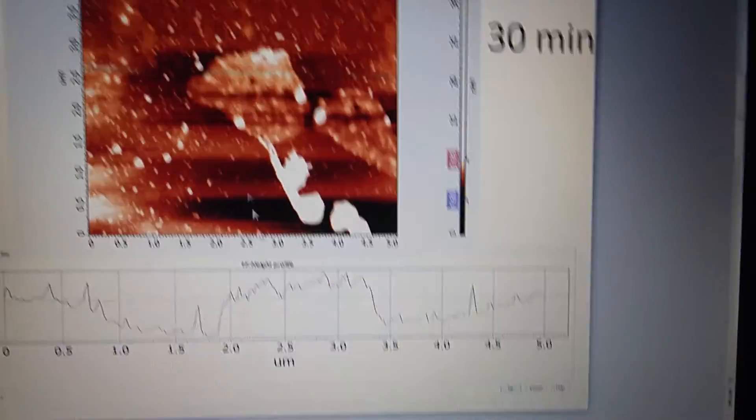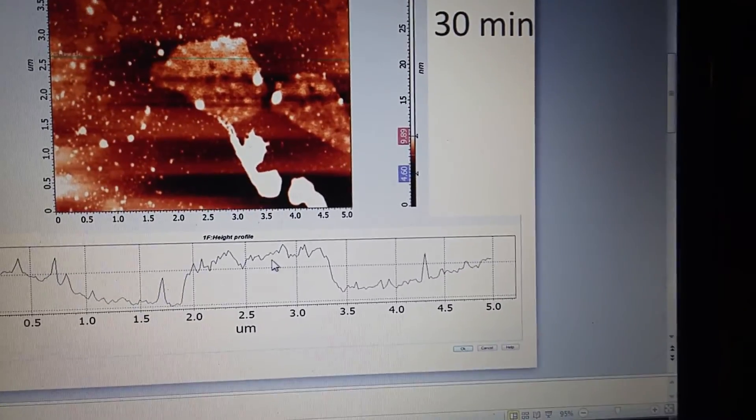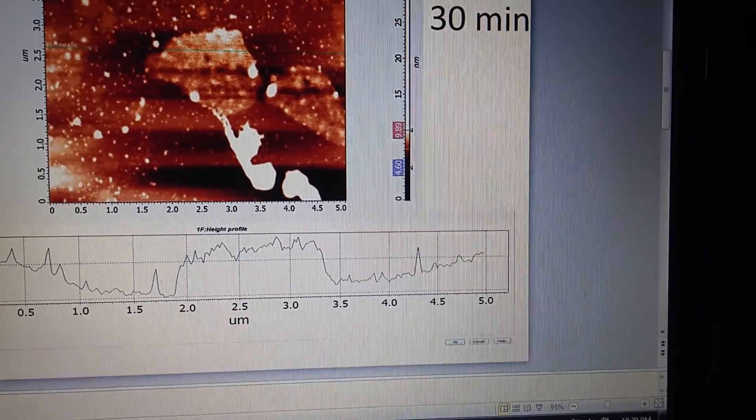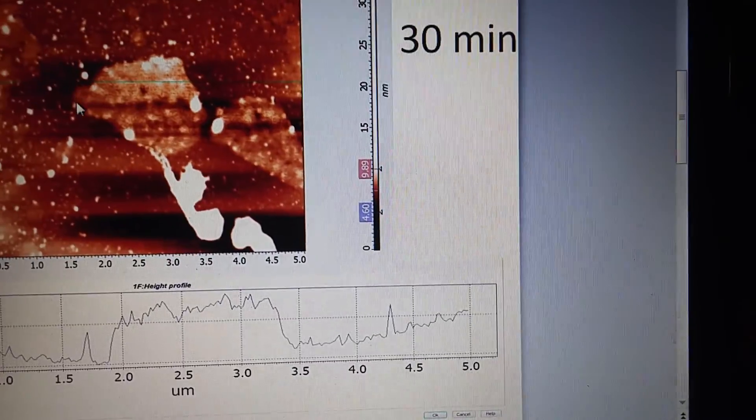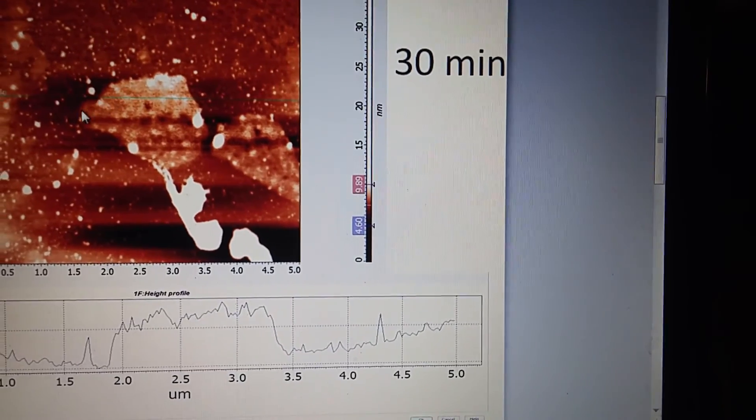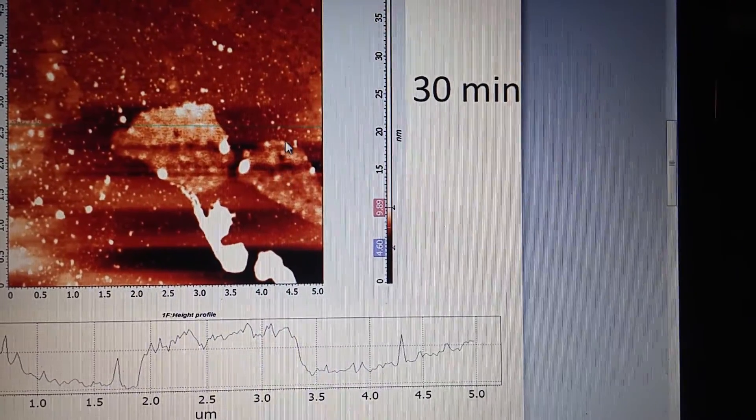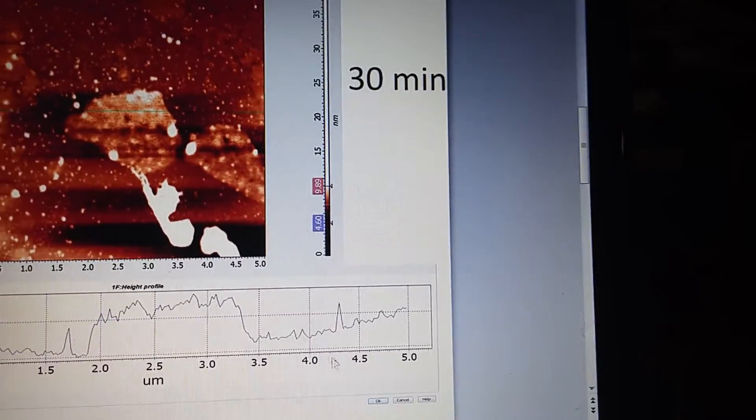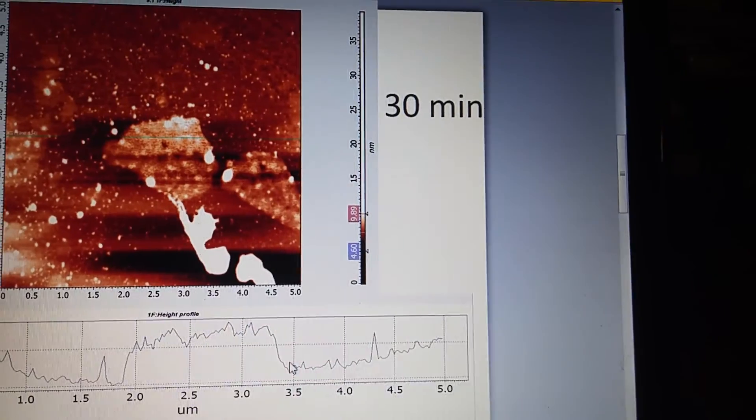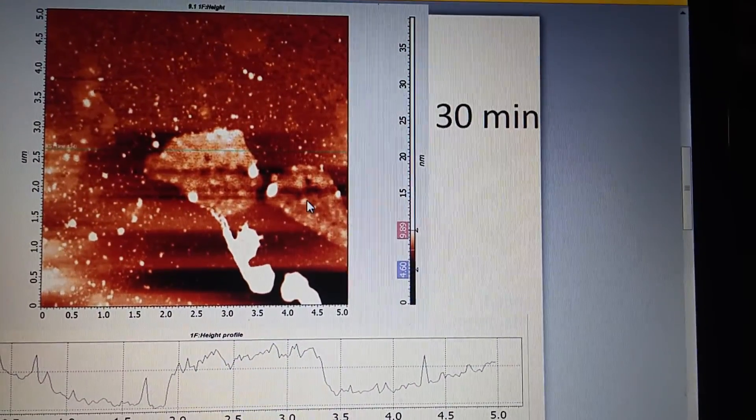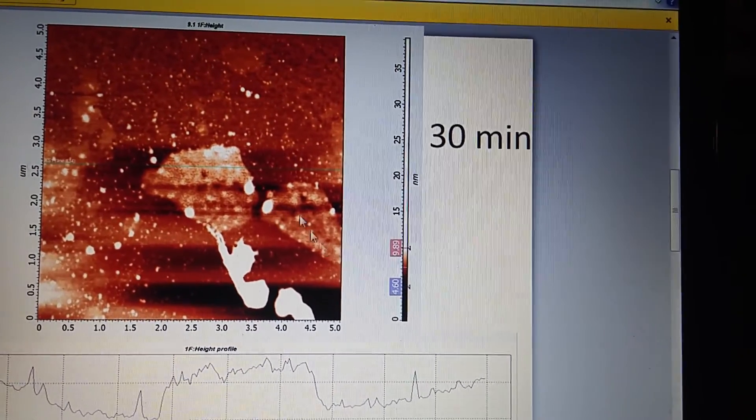And then here's another example. This is 2 nanometers in height right here. If you can see this band, a little bit over 2 nanometers. And then over here, here's another part of the flake. And that is actually an individual, that's probably a 2 atom thick individual flake right there sitting there. And there's another one right there. And actually that is probably, this one, well no, actually that's the ridge floor. This one is less high than that one. So that gives you an idea.